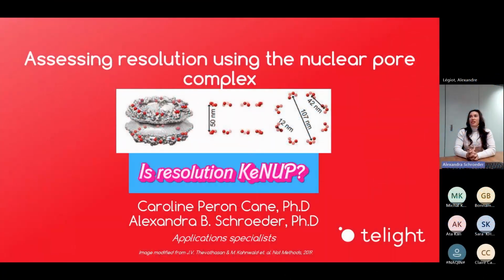So, as I mentioned, today we're going to be talking about a particular structure that is very relevant in biology. The purpose of this talk is meant to be very general and kind of as an introduction not only to this structure but also to resolution. But our focus today is going to be on using the nucleopore complex, which is made up of these proteins called nucleoporins, often referred to as NUPs.